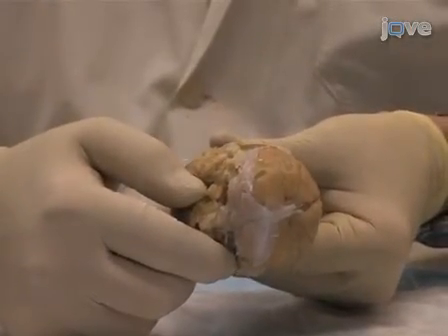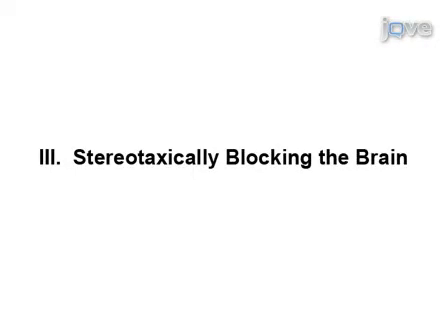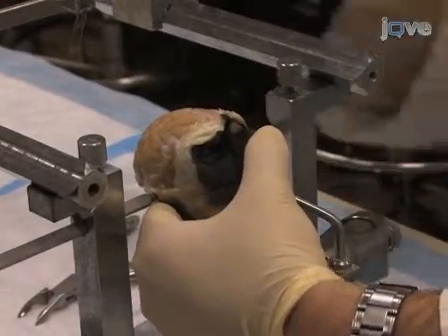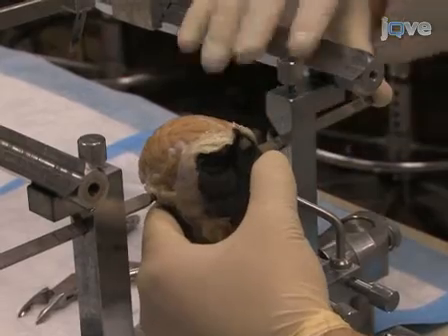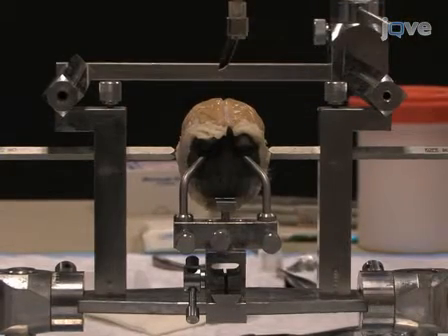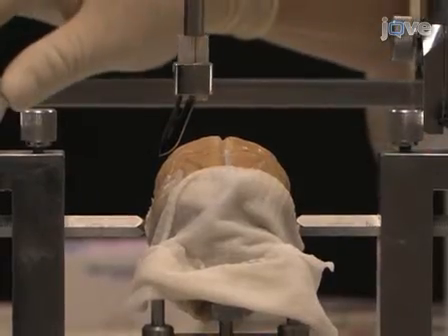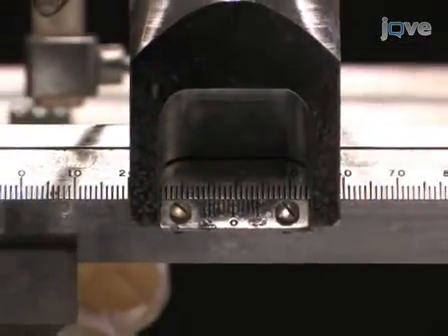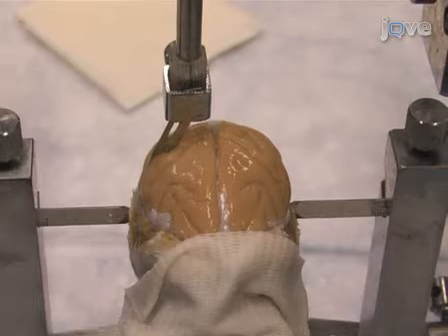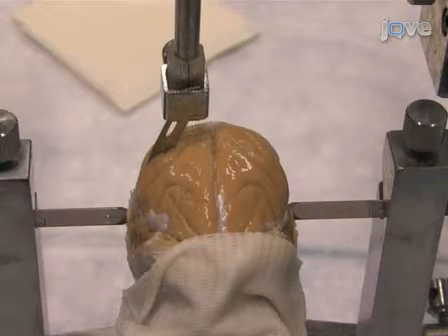Now the skull is ready to go in the stereotaxic manipulator. To begin stereotaxically blocking the brain, place the head into the frame. Adjust the eye, palate, and ear bars as you would for stereotaxic surgery. Place the stereotaxic manipulator in the predetermined anterior-posterior, or AP axis. To begin blocking the brain, position the manipulator to the far left or right side of the brain and lower the blade to make your first cut. The blade will be perpendicular to the midline of the brain, cutting in the coronal plane.